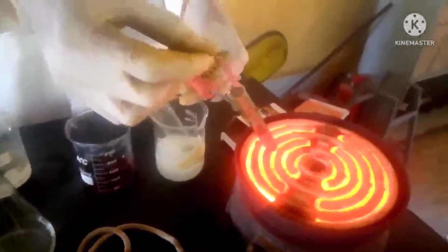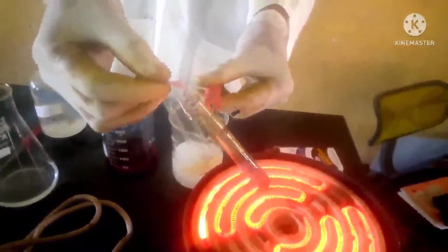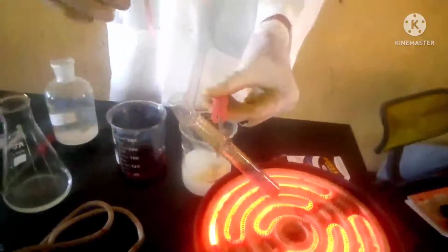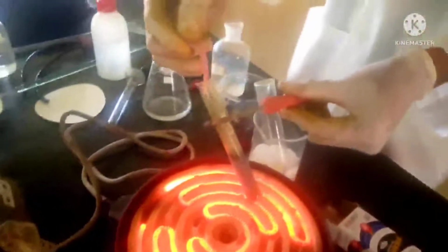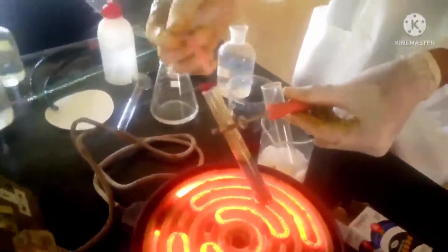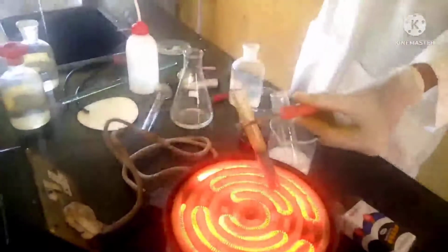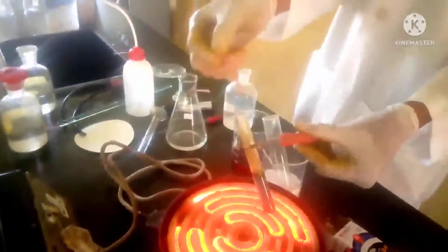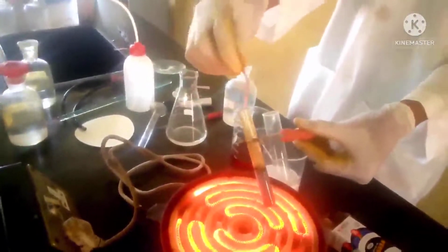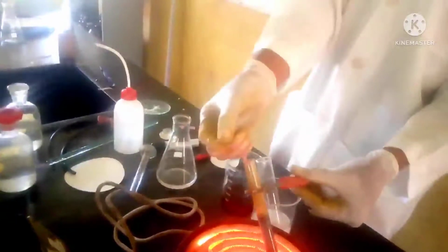Heat it very well. It's turning blue, but it's taking some time. It's turning blue gradually.